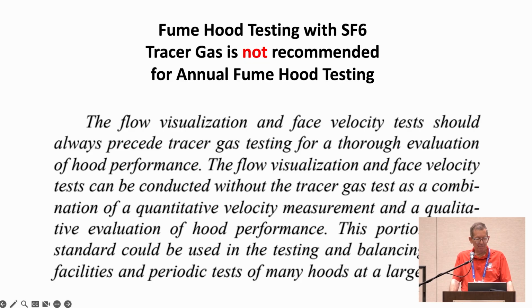Now we're spawn-minded. So, one of the things is that most of you are doing what we call annual recertification. You test your hoods once a year to make sure they're still good. If you read the standard in detail, it says, we do not, as ASHRAE, recommend using SF6 for that annual test.